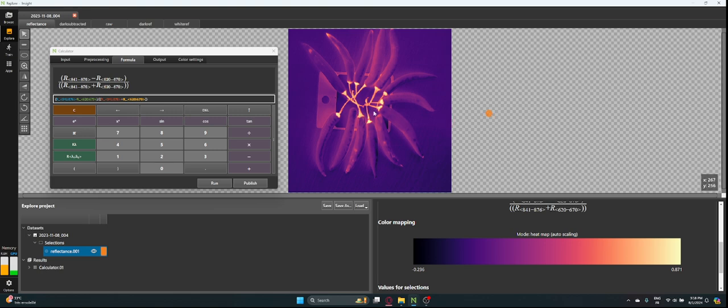You can see that makes sense, because on all the stems it's more or less towards positive, meaning it corresponds to vegetation, because it's the wood of the vegetation. Some parts of it are already very dry. A lot of water here. You can see some is not too ripe, some here as well. But for all this, there's some calculation you need to do. You need to know what wavelengths you want to look at. This is just an example of NDVI.